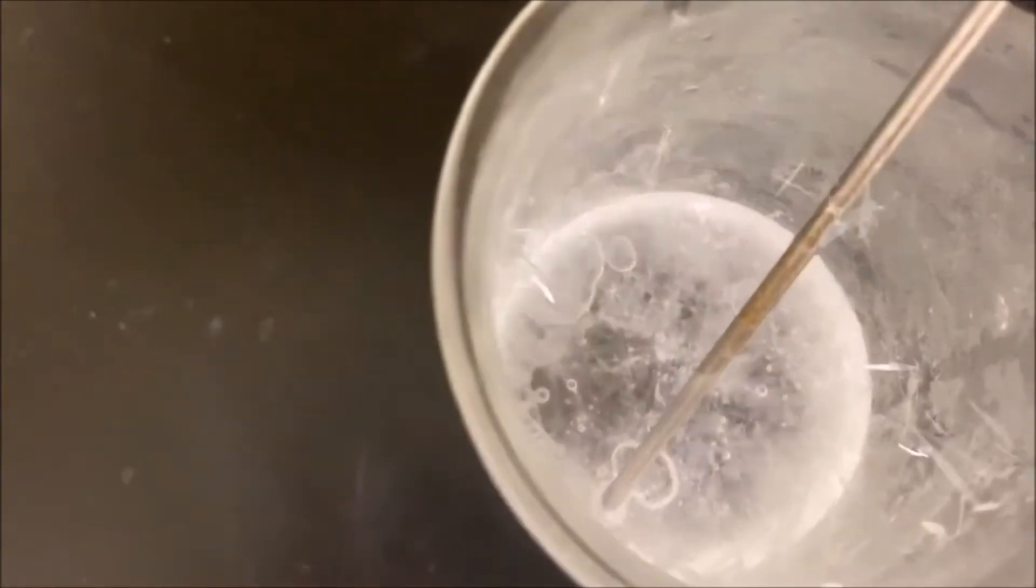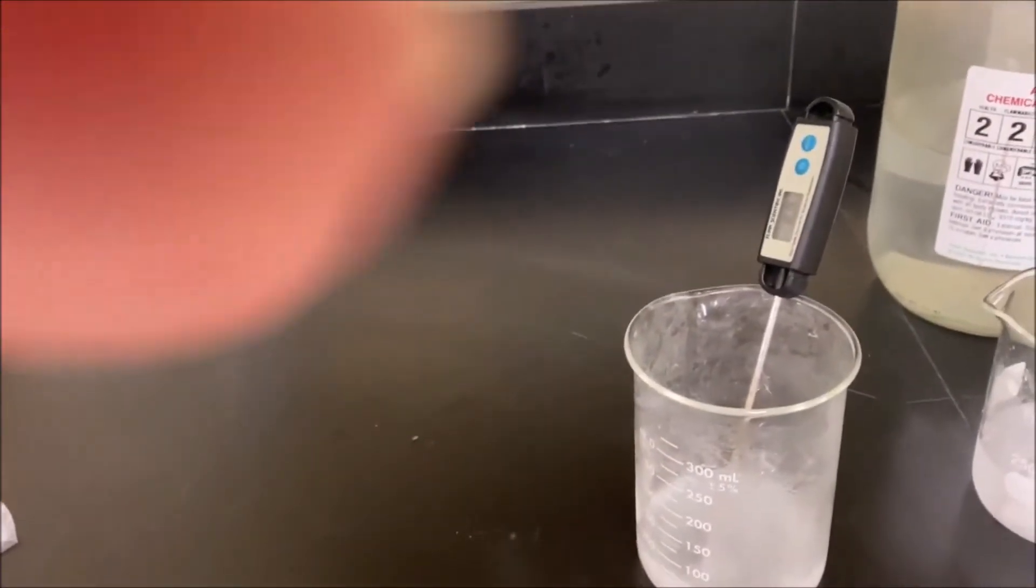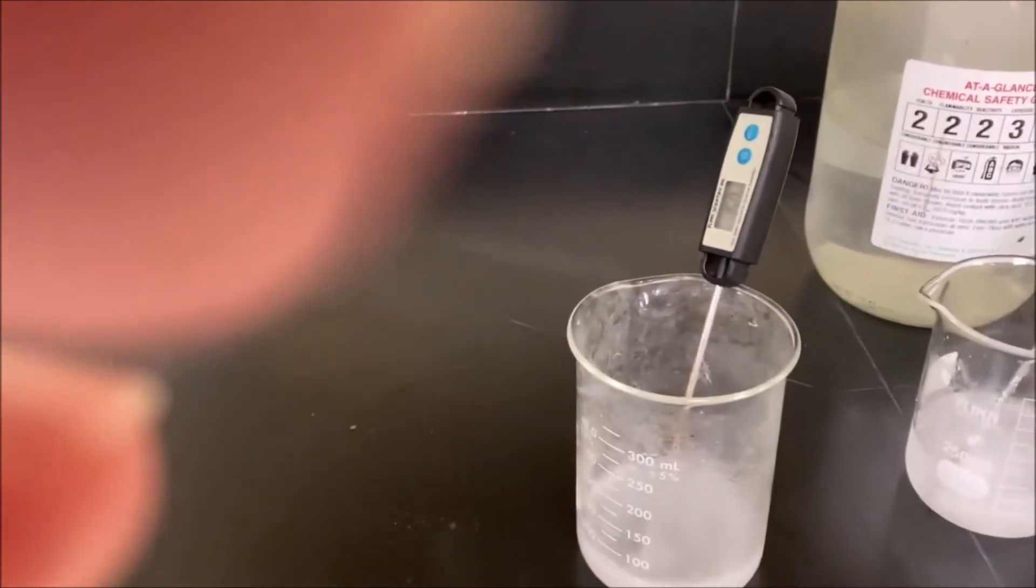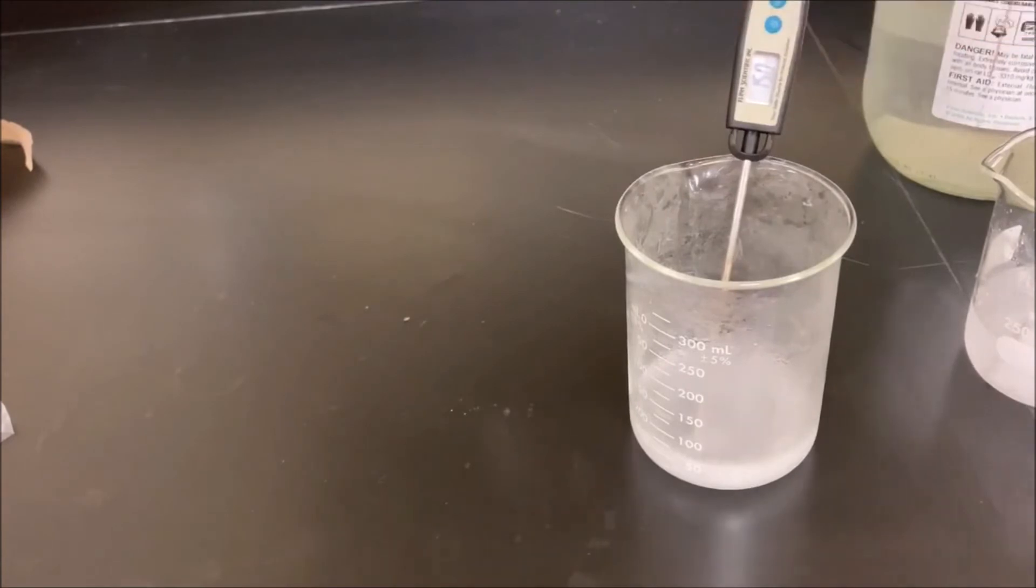But for this one we're going to go ahead and take that solid frozen acetic acid, glacial acetic acid, and this time we're going to add a solution of baking soda and see what happens. So currently that's starting to melt.